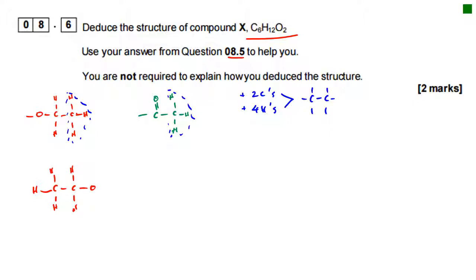Alright, and our green bit of the molecule is our other end, because CH2 groups are good in the middle. Alright, so we're going to leave our green for a little bit and put our 2 CH2 groups in, like that, and then we can just finish off with our green bit of the molecule.